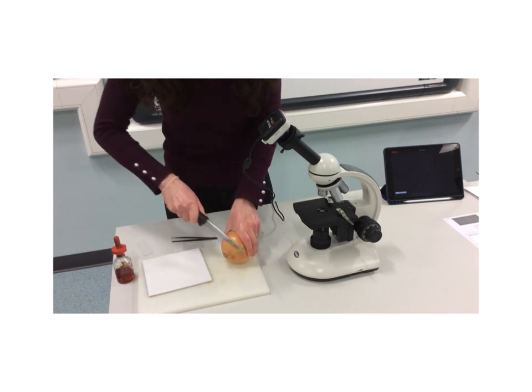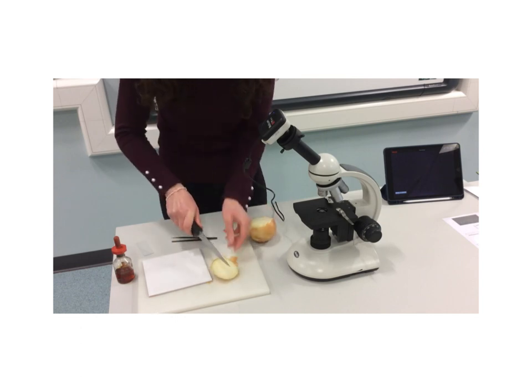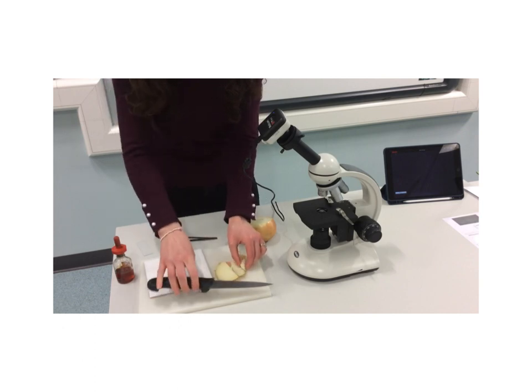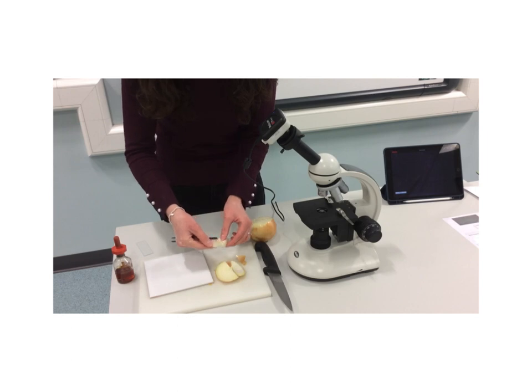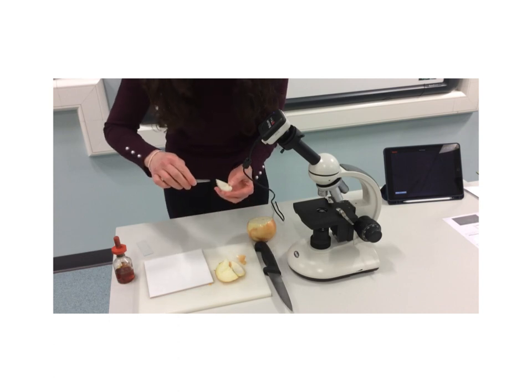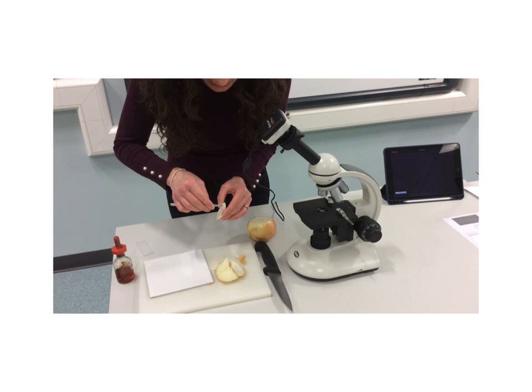So I'm just going to cut off the top of my onion. The first thing I'm doing is getting a section of my onion, because if I was to put the whole onion in, it would be far too thick. I basically just need one layer of my onion cells. So I'm going to get right down to just one little segment of my onion, and then I'm going to try and peel off a very, very thin layer. This is sometimes easier said than done.